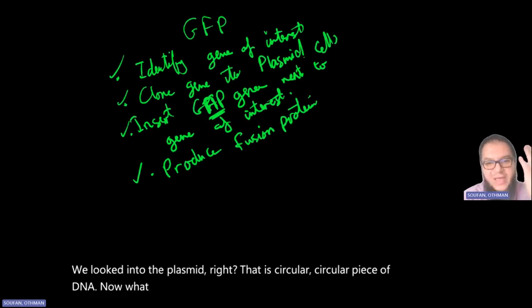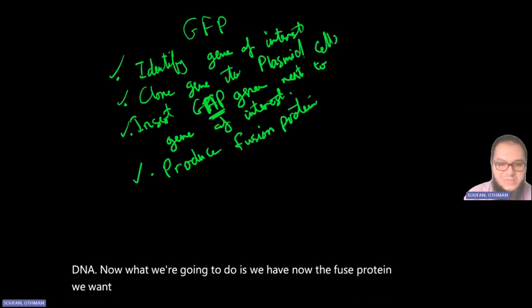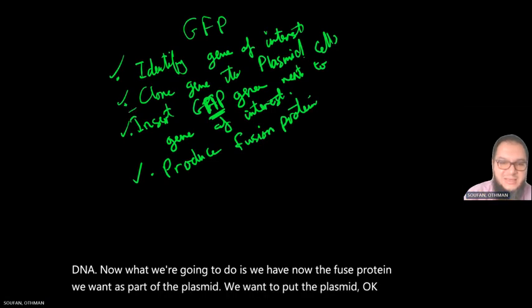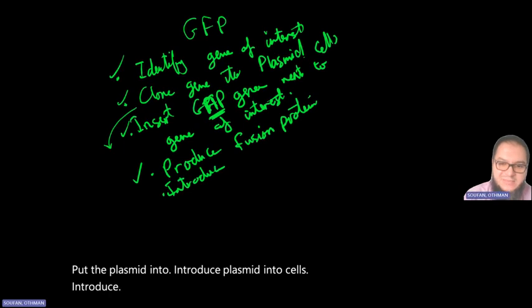Now that we have the fused construct, we want to introduce the plasmid into cells.